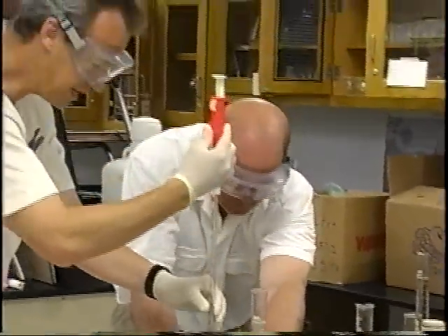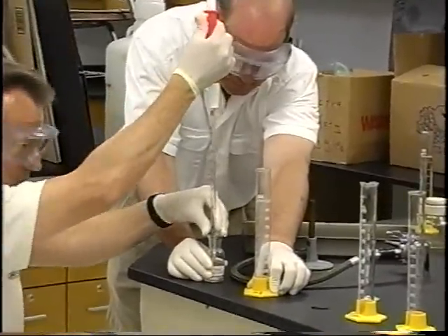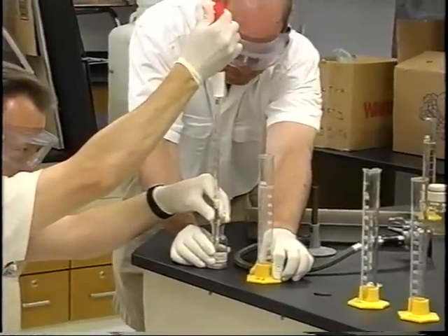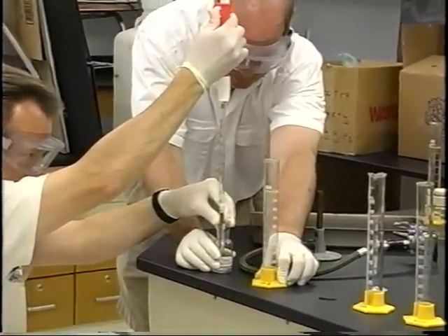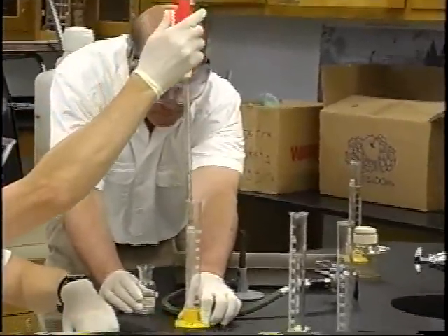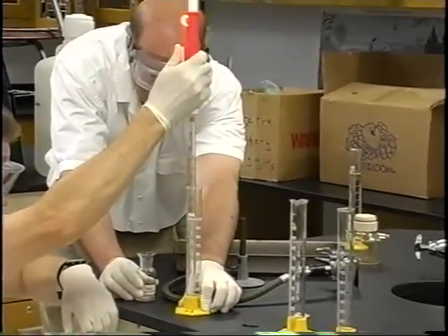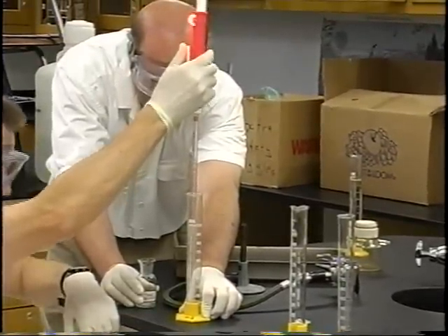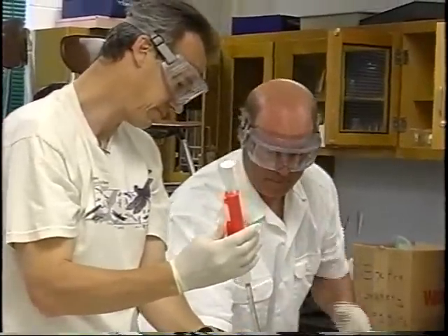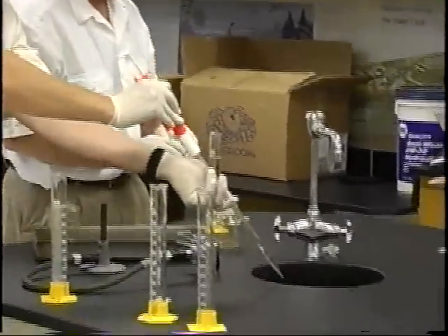So what I want to do is go back into my river water sample, and it doesn't matter what you go up to now. You only need to add one. So just to make sure, I'm going to fill it to 5. Nice and carefully. And drop this down to 6, so I'll have 11. I got an extra drop there. Actually, I want to waste that down the drain. It's pretty harmless river water.